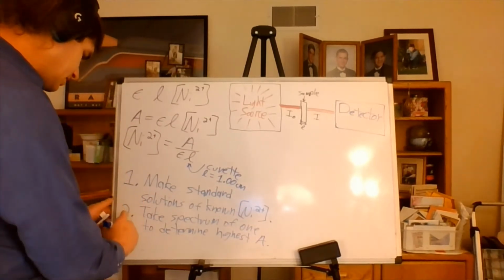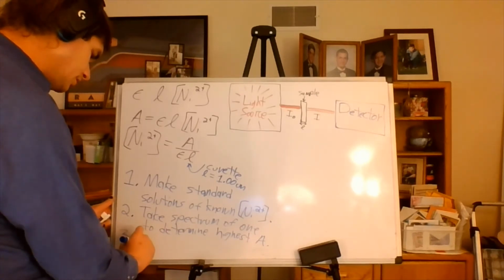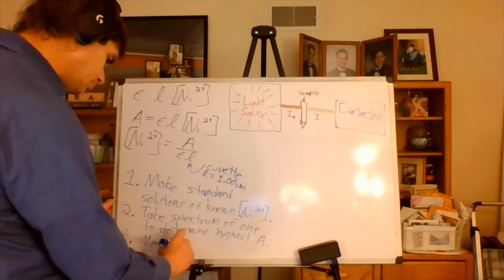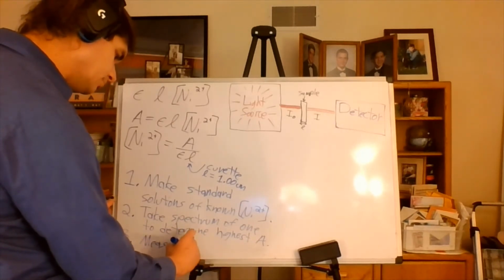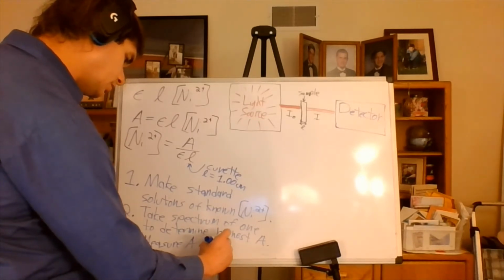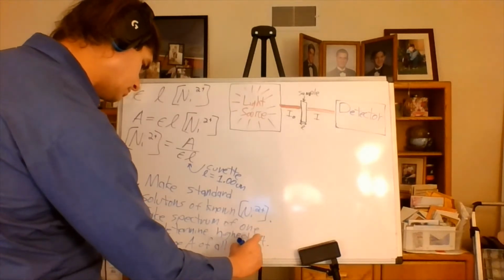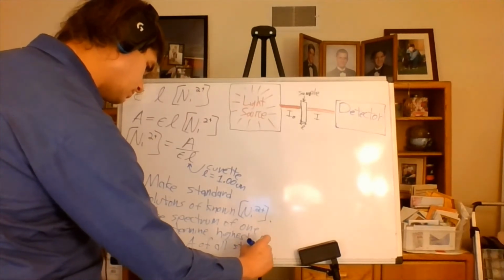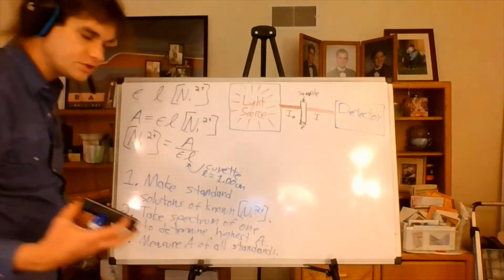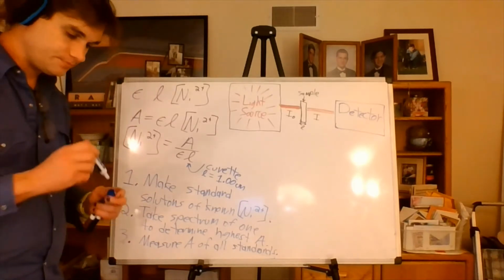Then after that, we want to measure the absorbance of all the standards so that we can plot them.